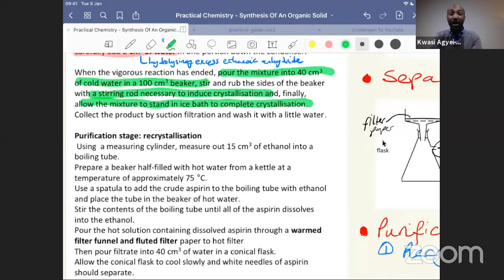These are that your solid must be dissolved in the minimum amount of hot solvent required to dissolve it. First of all, your solid can't dissolve in the cold solvent, otherwise you're not going to be able to form crystals. So you want to find a solvent that your solid only dissolves in when very hot. So again, very hot solvent and the minimum amount of hot solvent.